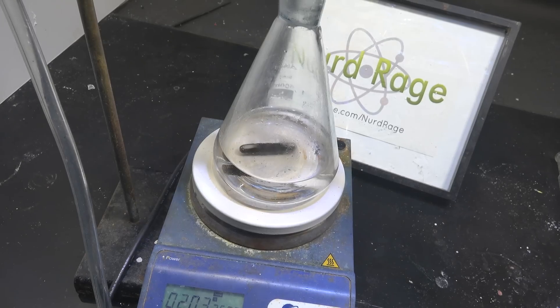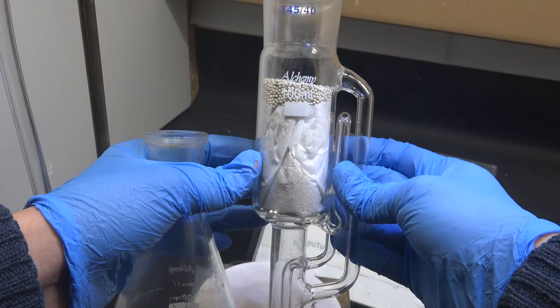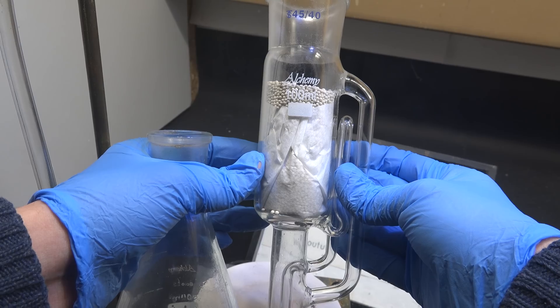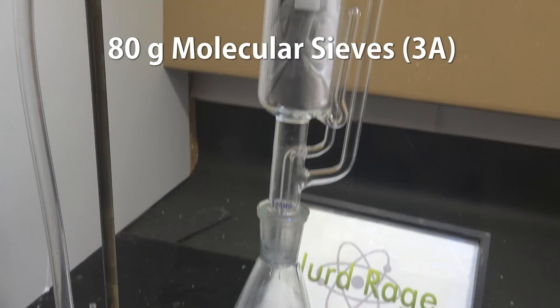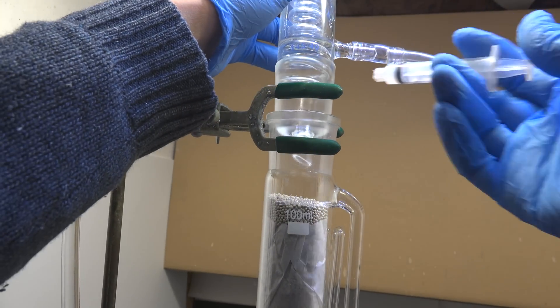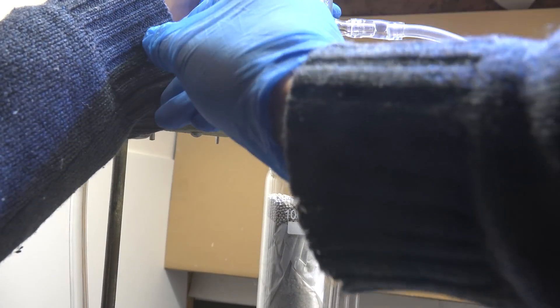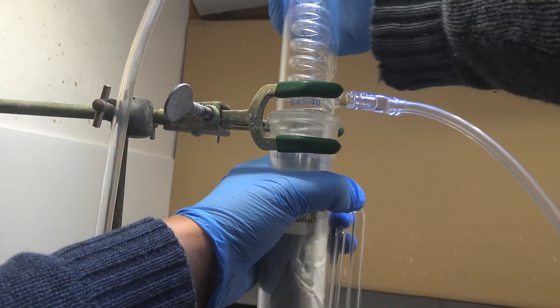Now for the important difference. Instead of a simple reflux apparatus, we set up a Soxhlet apparatus filled with molecular sieves 3A — I have about 80 g worth. Mine is bagged with filter paper to prevent the beads from being sucked through the siphon tube and falling into the boiling flask. The molecular sieves were previously dried on a hot plate at 250°C for 3 hours.